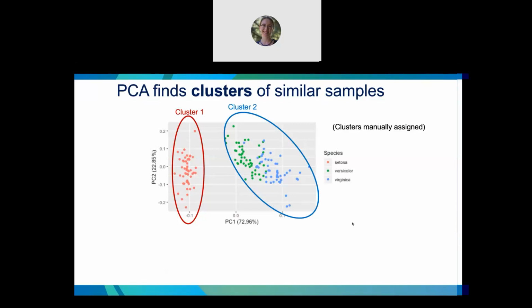So I was going to say, are there any questions? And I see that there is already one. How do you calculate the PC vectors? I am not in a position right now to, off the top of my head, talk about this. I can come back tomorrow with a nice explanation. Nival says a lot of linear algebra. That's true. That's about as detailed as I could get about this.